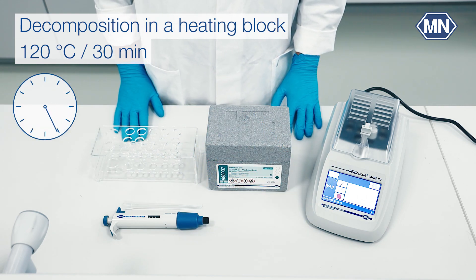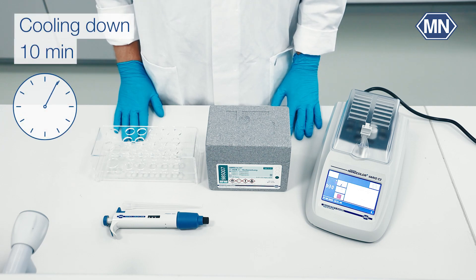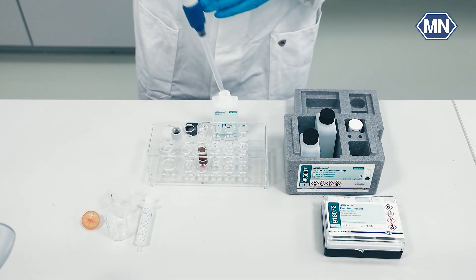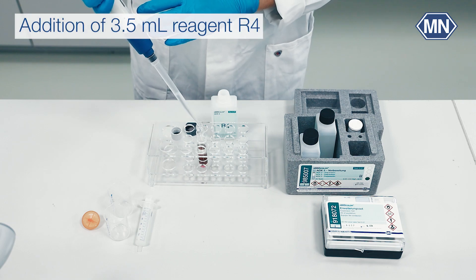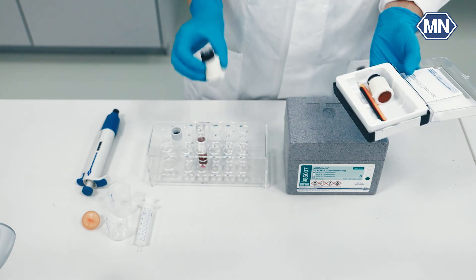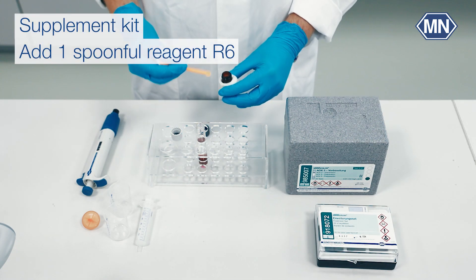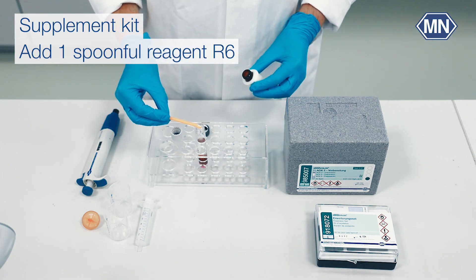After decomposition, carefully remove the tube and allow it to cool down for a further 10 minutes before proceeding to the next step. Add 3.5 ml of R4 included in the preparation box to the cold test tube. If you are using the supplement kit, please perform the following additional step: add a level spoonful of reagent R6 with the orange spoon.